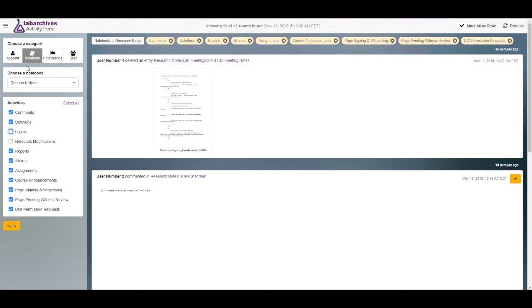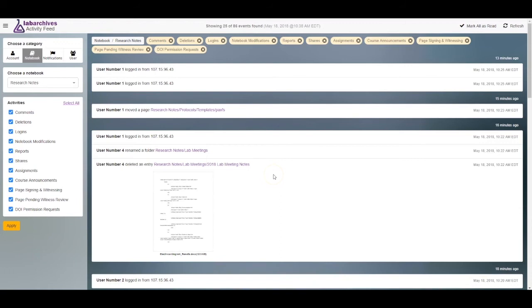Each category has a list of activity filters that can be turned on or off by clicking the checkbox and selecting Apply. You can scroll down the page to view older notifications.